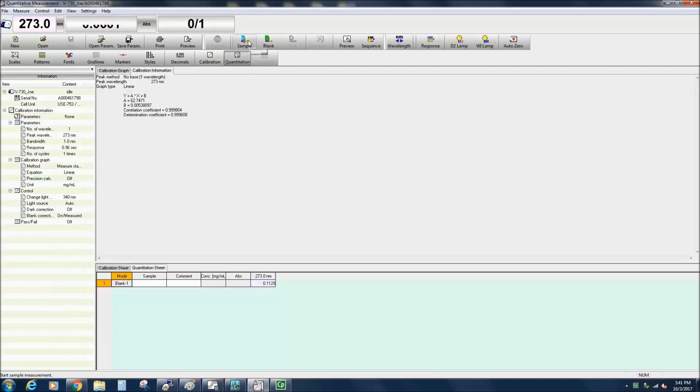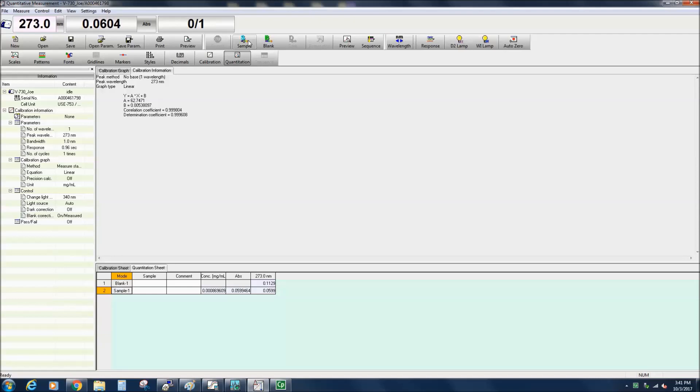The measured absorbance value will then be automatically entered into the absorbance and peak wavelength columns for sample 1, along with the concentration calculated using the previously created calibration curve.